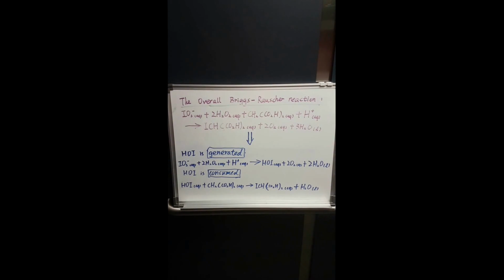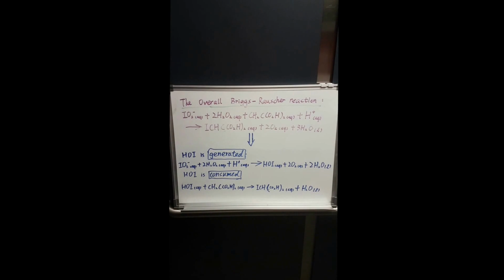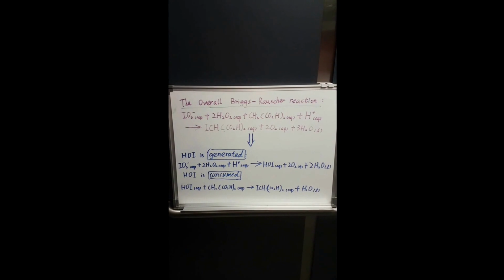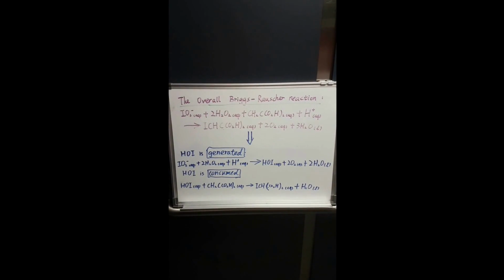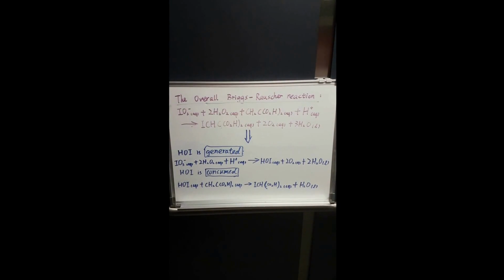The color changes observed during the reaction are due to the oscillations in the concentration of iodine, I2, and iodide ions, I-. The yellow color is attributed to an increase in the I2 concentration. The dark blue color arises from the formation of a starch-iodine complex as both the I- and I2 concentrations increase. The colorless solution is caused by the decline in I2 concentration and the continued rise in I- concentration.